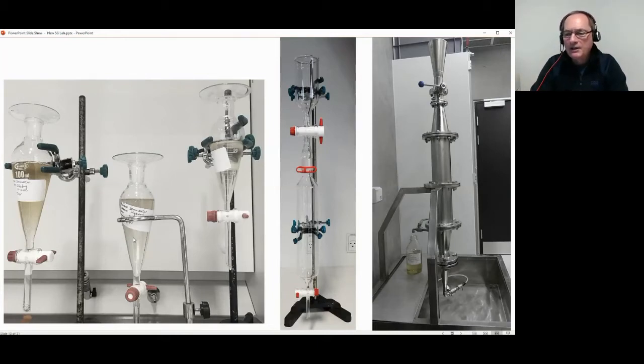If we have really big samples, we are using something we call the rocket, which can take quite a kilogram of material and so on. But again, things have pluses and minuses, and sometimes it's easier to use the small funnels and have more of them than using the big machine because it's heavy to operate.